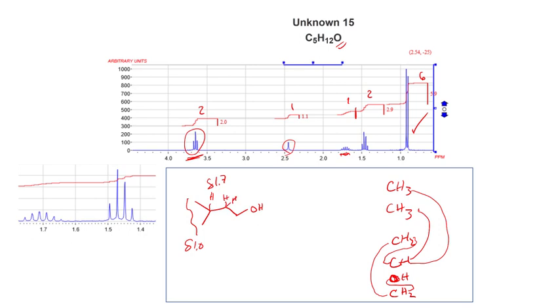CH2s, right here next to three different hydrogens. So here you go, one on the left, two on the right. The splitting turned out to be about the same because they're on a chain, and it looks like a quartet. Technically, it's a doublet of triplets, but it's just lined up enough to give us the right splitting at delta 1.5, our OH at delta 2.5, and our CH2 connected to the OH at 3.7. There you have it.